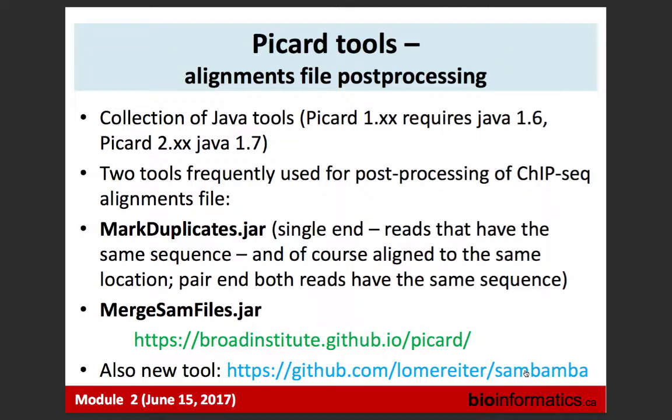My question was a bit similar. Why don't we mark the duplicates before the alignment? That would save quite a bit. It will, except for the fact of mismatches and sequence quality. But also, how would you do it? You have this file with 100 million reads, so you have to sort through this file and find those sequences which are identical. It's quite a computationally involved step. So duplicates are discovered by alignment. Okay. Yes.